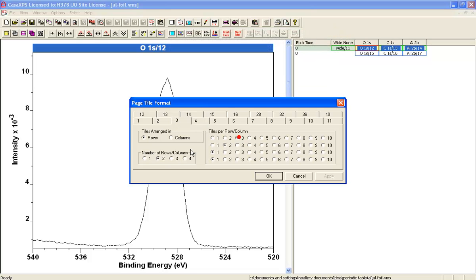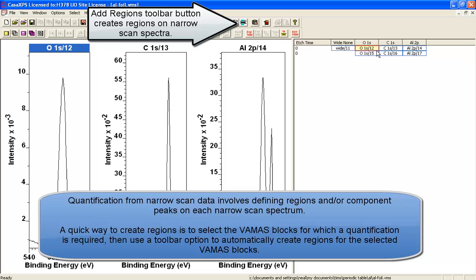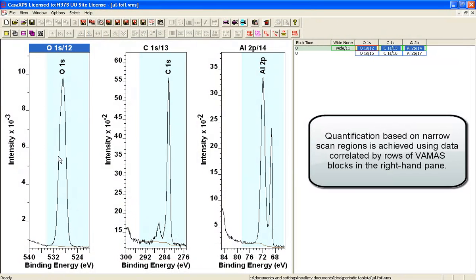Let's go for 3, 1, 1 and select these and press the button that says add regions. You have immediately got regions defined on these spectra.